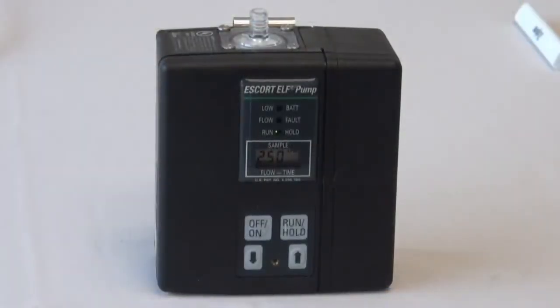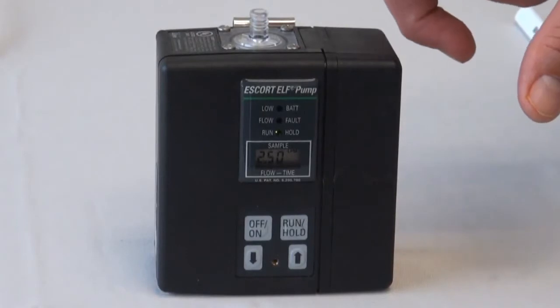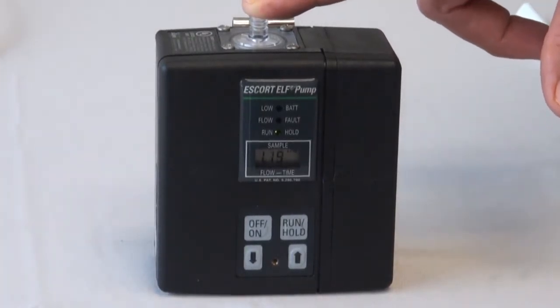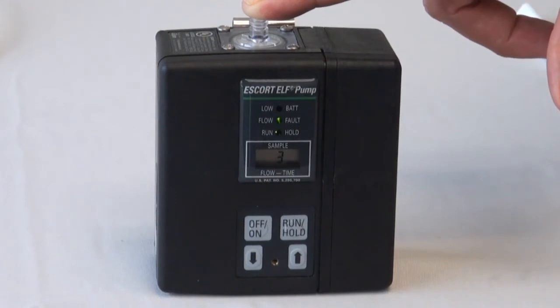Allow the pump to operate for 10 to 15 minutes at 2.5 liters per minute. To check for leaks, temporarily block the pump inlet. The LCD display should be at 0.02 liters per minute or less.